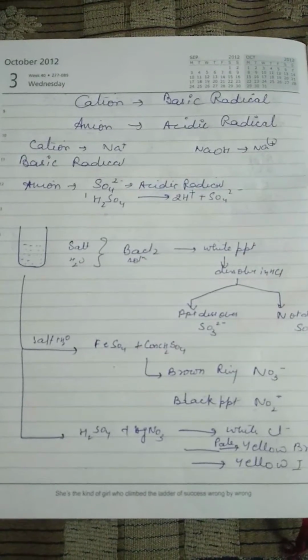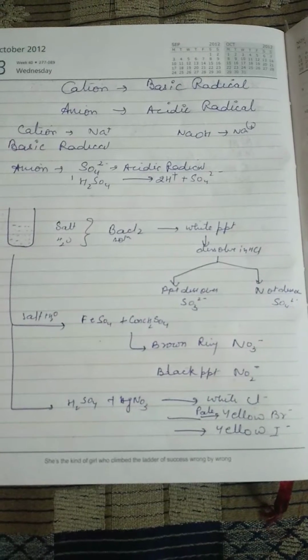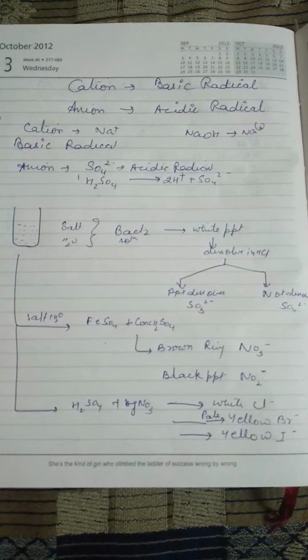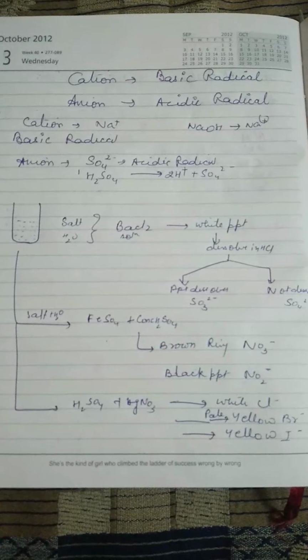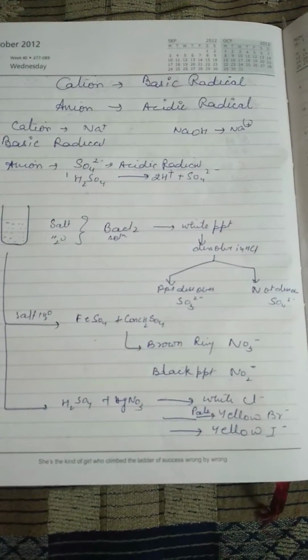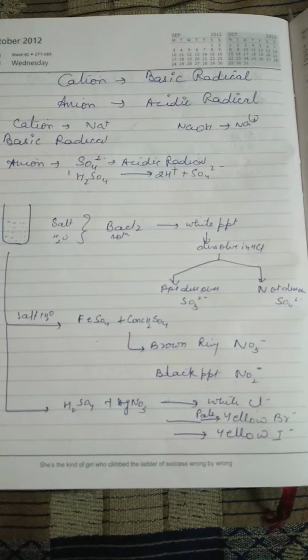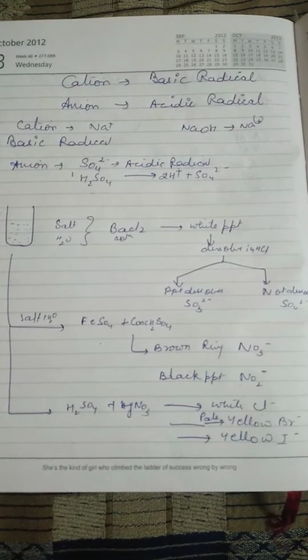Now coming on to the salt analysis, I have described some of it briefly, how you can check whatever anions or cations are present in your salt which will be given to you in your board practical exams. So, a few very brief examples I have given, like how to check. First you take your salt, a pinch of salt, a very small quantity you have to take, don't go for a bulk quantity. Take a little salt, add water to it.